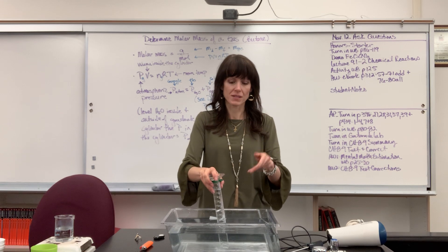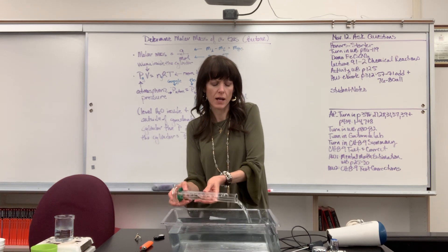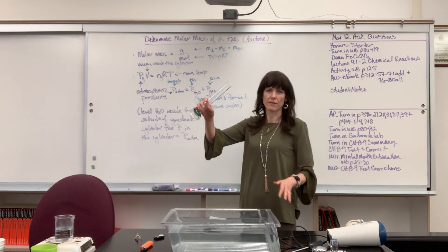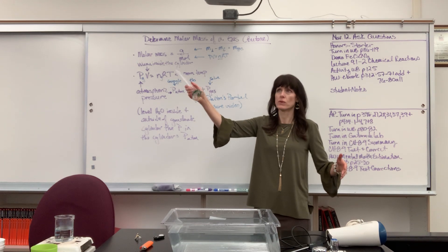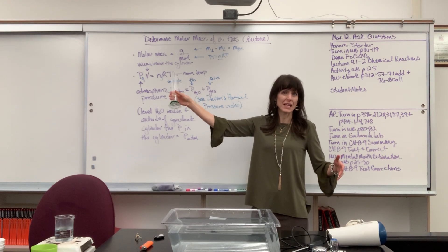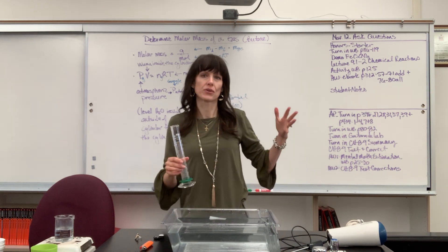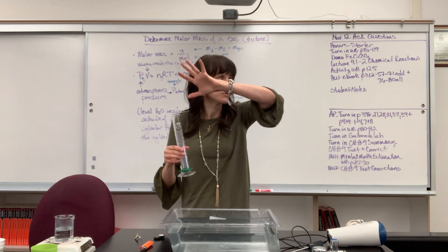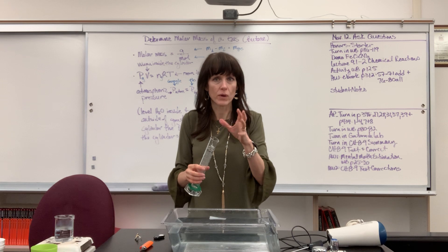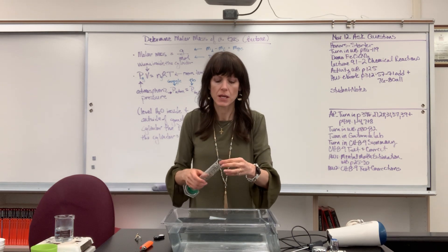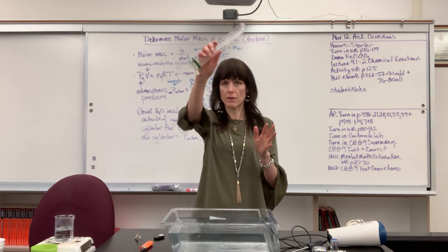Two last things. First: once you're done, hold the graduated cylinder up, let the water out, and wave it around so the 80 mL of butane gas disperses into the room. We don't want any concentrated gas. Those gas molecules, per kinetic molecular theory, are going to fill the room. You don't want to keep them all concentrated in one place where they could ignite — that's bad. So just wave it around.